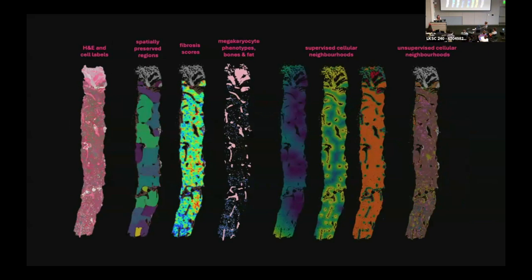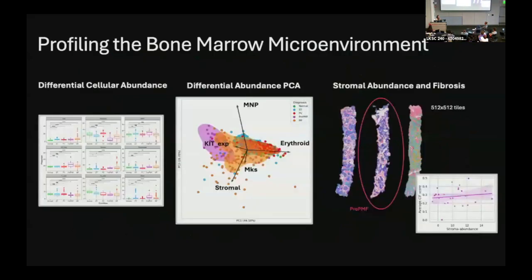So I'm just going to present a couple of preliminary slides of the questions that we're trying to think about. So first, even without the spatial context, we've got a nice single cell data set, where importantly with stromal cells as well. So we can see that it spans the whole range of MPNs. Already we can see a distinction between the ET and PV, which are more benign, clustering closer to normal. And then you've got your pre-PMF following into your myelofibrosis samples. And pre-PMF is a transitionary state.